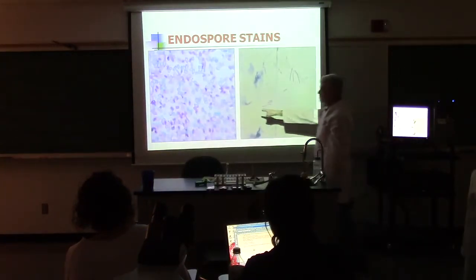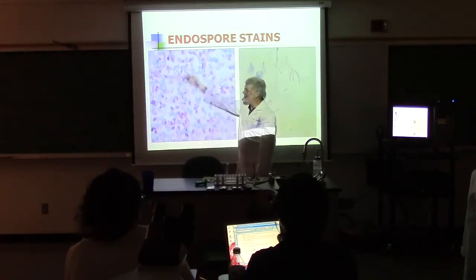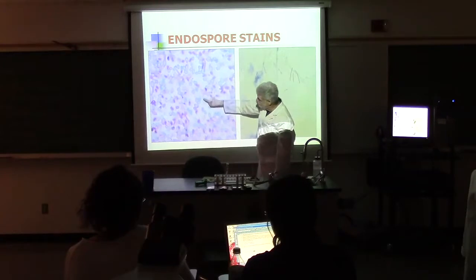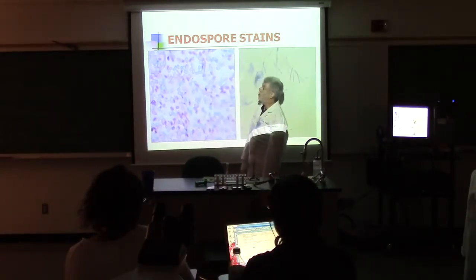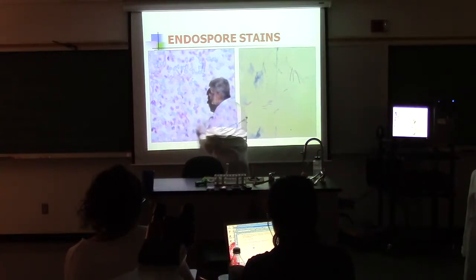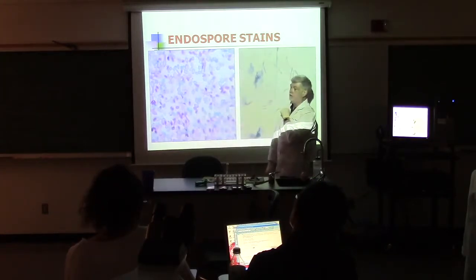Look at this one over here. Old culture. This is subtilis. Almost everything has gone to endospores. So if you see lots of repeating ovals, egg shapes, that have that sort of clearing in the center, you know that this whole thing essentially has gone to endospores. There's a rod, there's a rod. There's a few rods. There's one or two that haven't ejected the endospore yet and haven't fallen apart. But most of these have ejected the endospore and the rod has fallen apart.